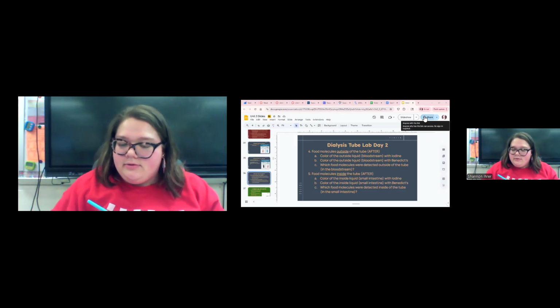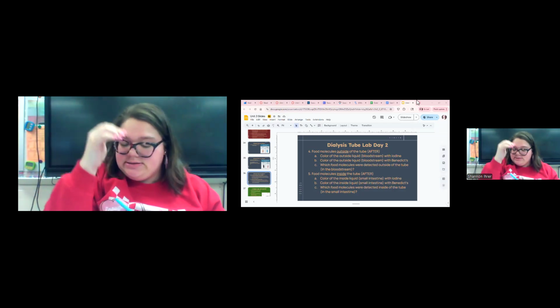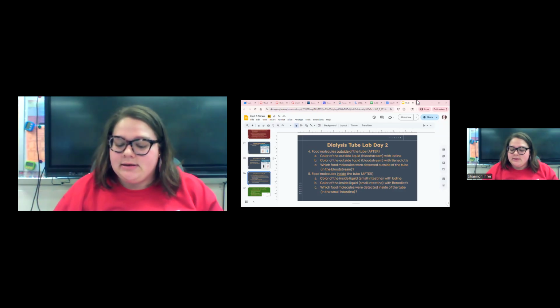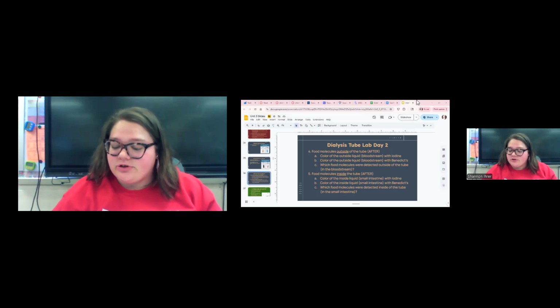Now there are the sense-making questions. Part 6 says, did any of the food molecules that started off inside of the dialysis tube end up outside of the tube? Explain what happened. Number 2, what do the class results tell us about the structure of the surface of the dialysis tubing?